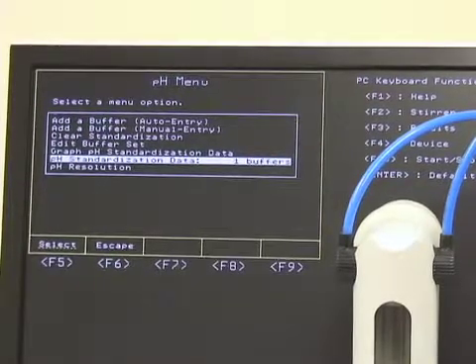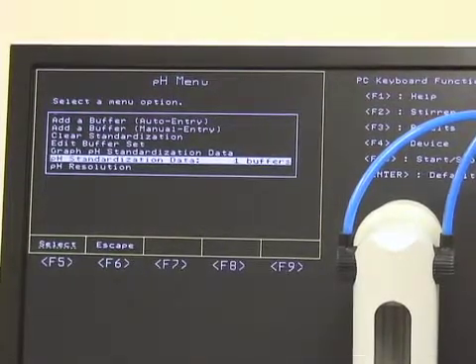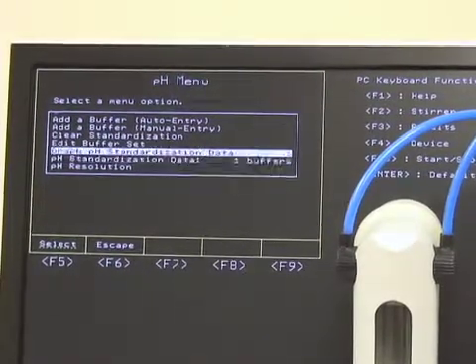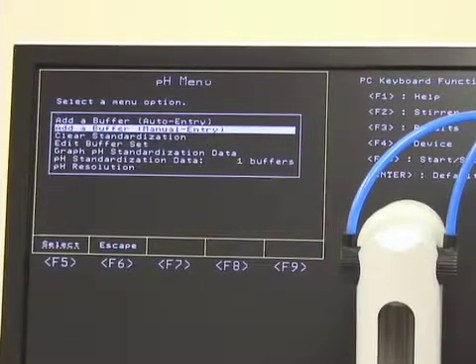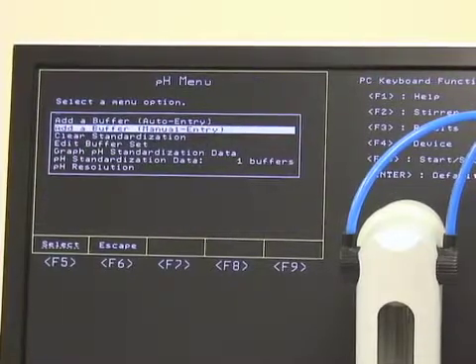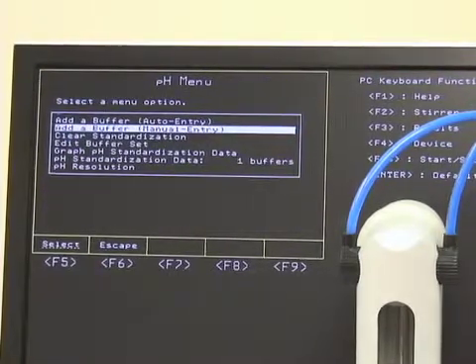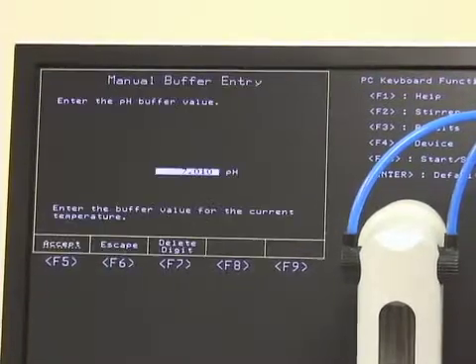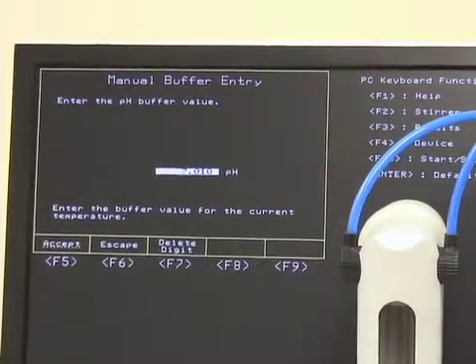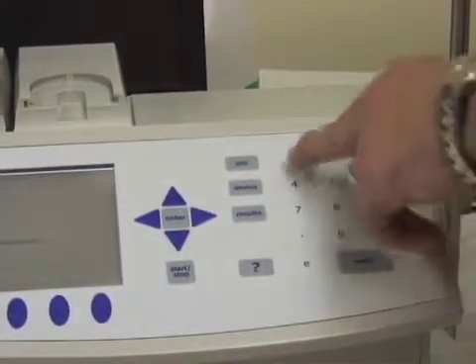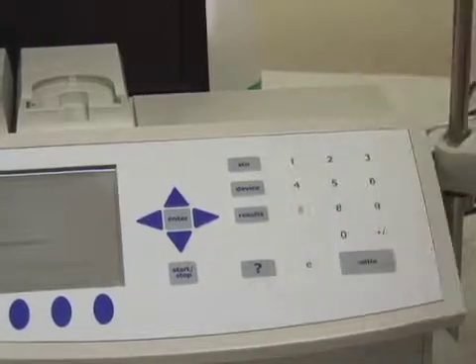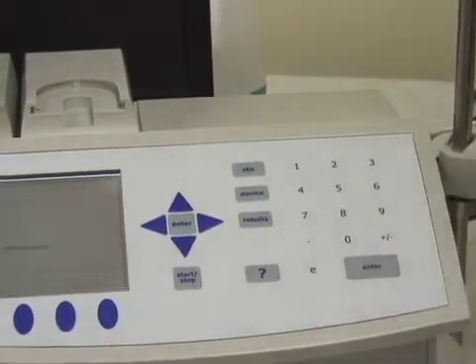So we've done 7, now we want to add our next buffer. Today we're only going to do 2, though you can do up to 4 — recommended is 3. We'll hit manual entry again. This time we're going to use our 3.01, so again to the keyboard: 3.01, and we'll prepare our sample.